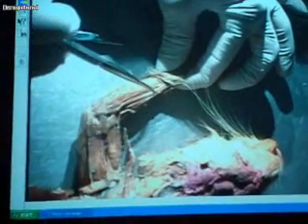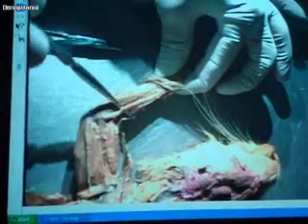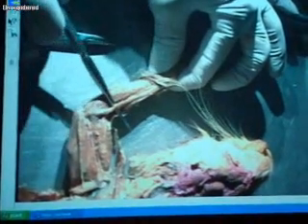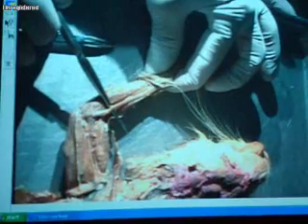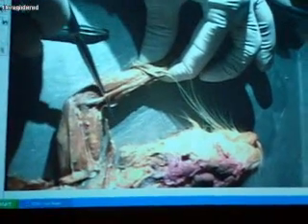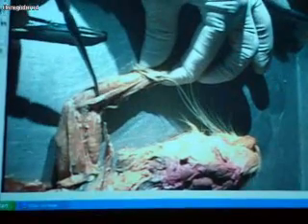If you palpate it, it feels hard. And then there's a very, very skinny muscle right next to that bone right here. You can see it actually inserts into the radius at an angle. That's pronator teres. And then right next to that is another muscle right here.